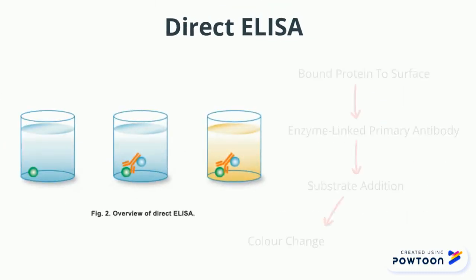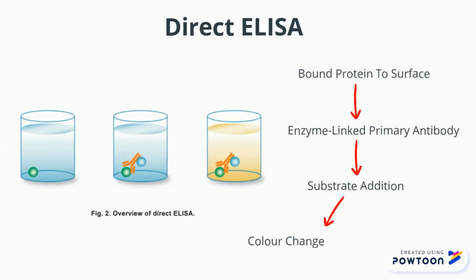The most basic form of ELISA is the direct ELISA, which involves a protein of interest being bound to a physical surface with its antigens, and the subsequent introduction of an antibody complementary to the antigen of the protein of interest being applied to the same surface, resulting in the formation of an antibody-protein of interest complex. The now bound protein of interest antibody will have an enzyme attached to it, and in the presence of the enzyme-specific substrate, the substrate will be catalyzed and the liquid solution surrounding the protein of interest antibody complex will undergo a visible change, indicating the protein of interest's presence.